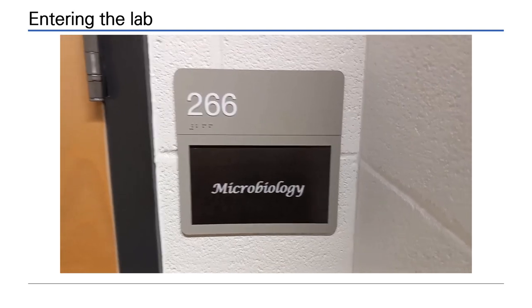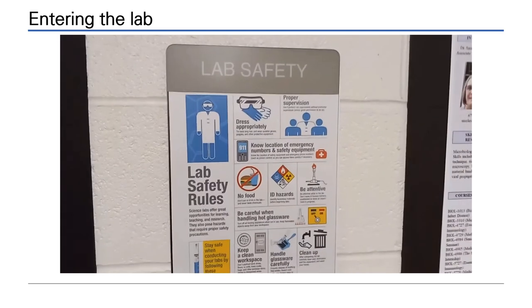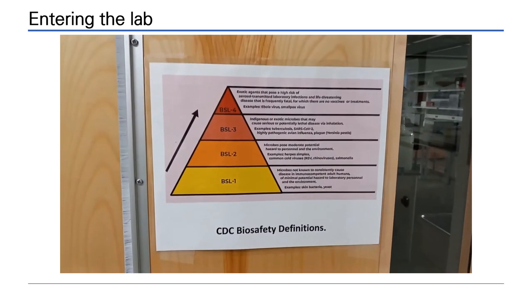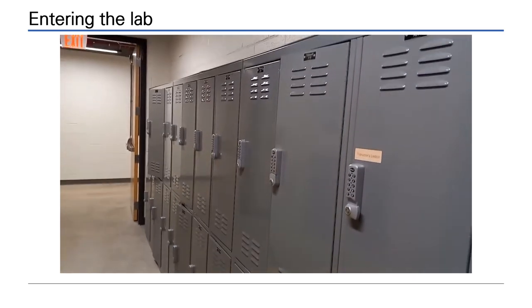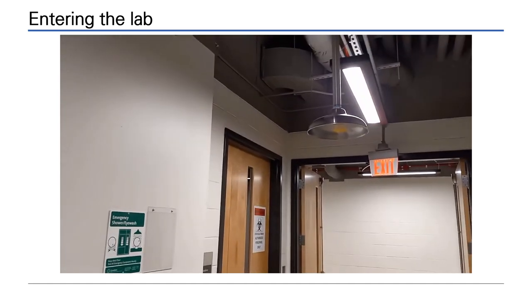Microbiology labs contain potential pathogens. Pay attention to all safety signs. No food or drink should enter the lab. General lab safety rules also apply and are posted outside the lab. Microbiology labs are considered a biosafety level 2 laboratory. All coats and book bags should be stored in lockers. Should you need it, there are emergency showers and eye washes. Never enter the microbiology lab without your instructor being present.